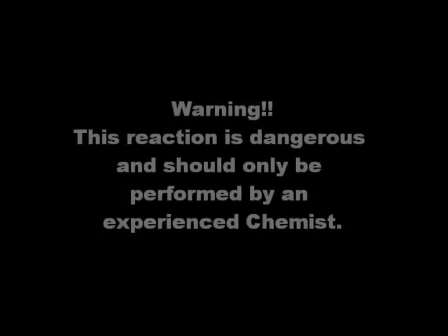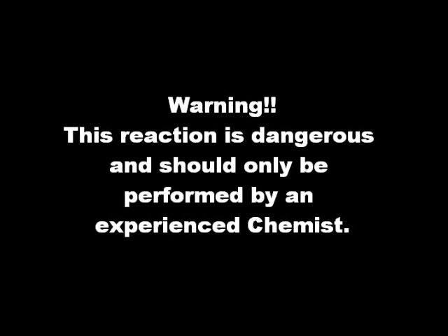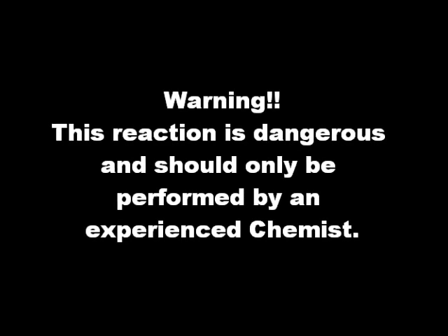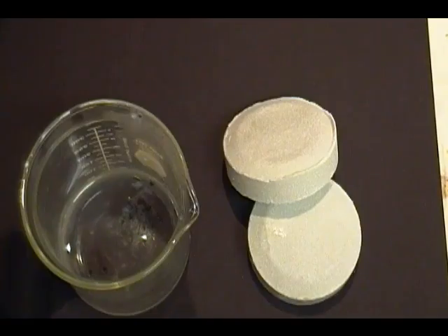Chloroform is a really useful solvent in organic chemistry and in this video I'll show you how to make a small amount. But first a word of caution: this reaction can get out of hand really fast and should not be attempted unless you are fully aware of the dangers. Also, chloroform is a suspected carcinogen and an environmental pollutant. If you make it, you must use and dispose of it properly.